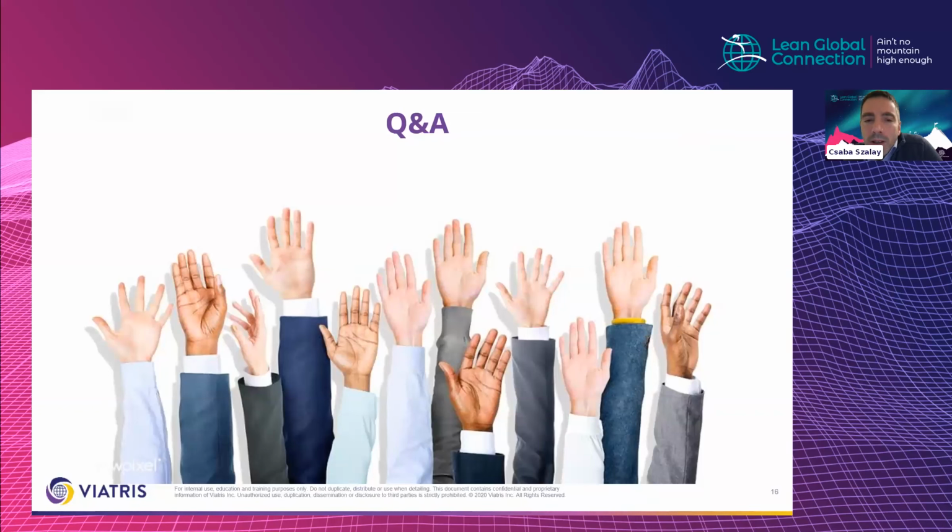Okay. Next question. How is the role of the supervisor? Do they have a verification role? How do they do that? So what's their role in teaching, in instructing people? Also at the beginning, one of the trainers was a supervisor, so their involvement was very high. Mostly they are responsible to assign the TWI trainers to the newcomers, and to be sure that they get the trainings at the right time, because some steps need to be one by one. And the order is very important.